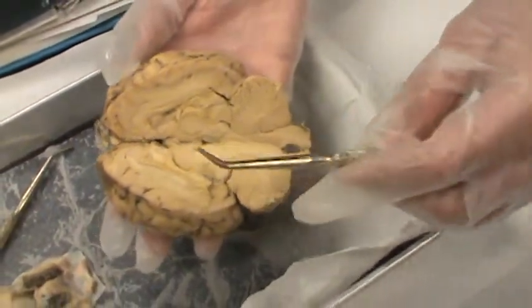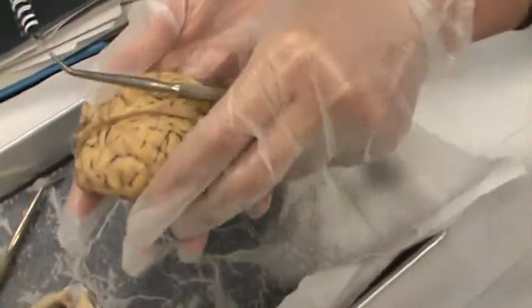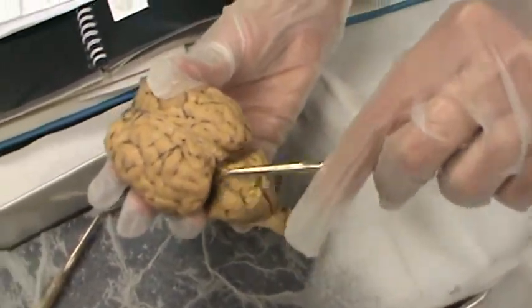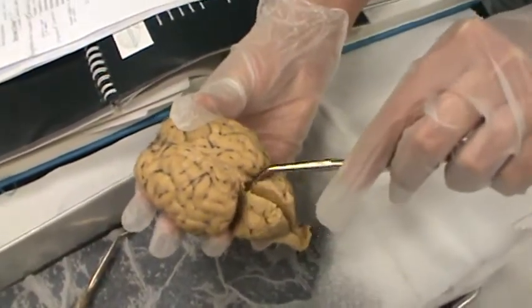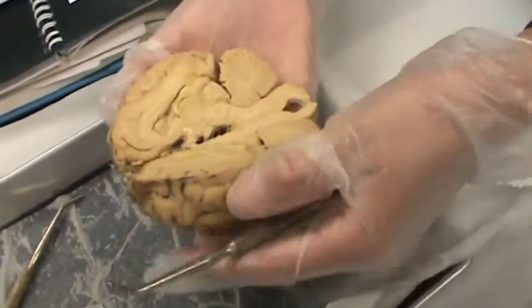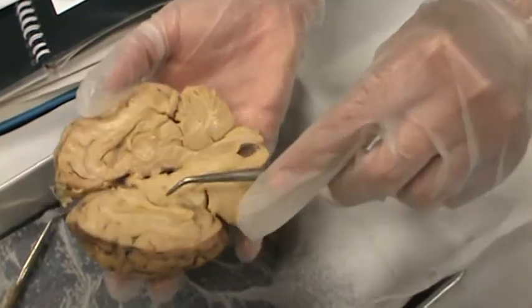The transverse fissure separates the cerebrum from the cerebellum, which would be this right here. Transverse fissure. The thalamus is the middle of the brain, in sagittal cut. This is the thalamus.